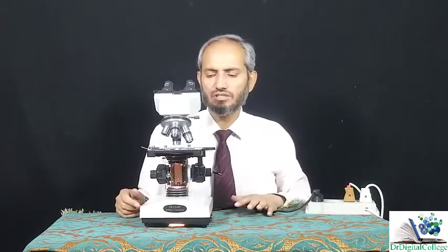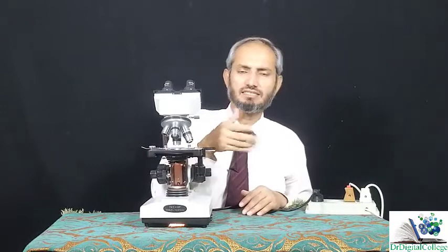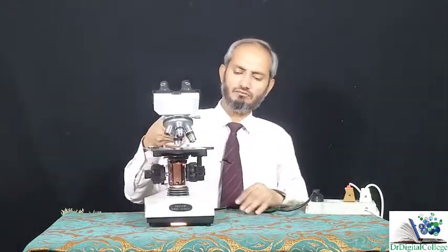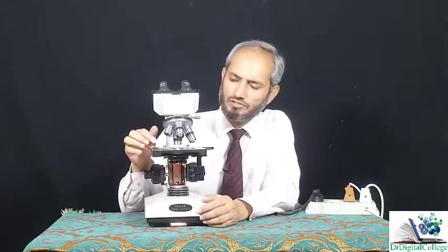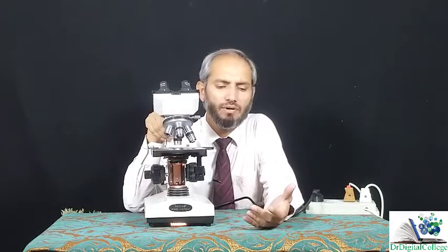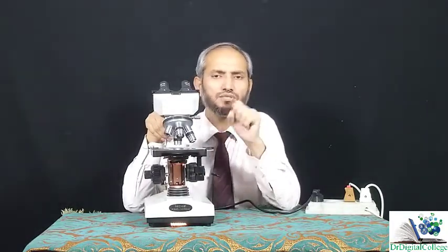Okay, so this is all about the focusing of your microscope. When you practice repeatedly, then you will be an expert at it. You will be good at doing the focusing very quickly. Okay, now the next part of the working of this light microscope is its resolution.